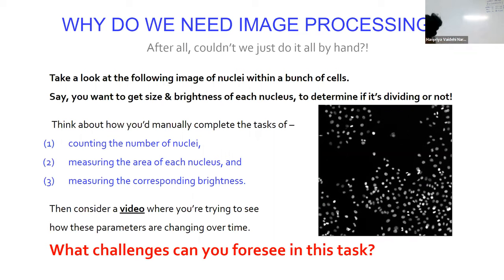Now, I want you to answer a simple question. Think about it for a few minutes. If I asked you to tell me the number of dividing cells in this image, and whether they're in S phase or G2 phase or whatever, by hand, just eyeballing the image.